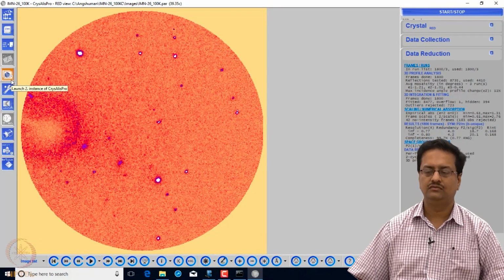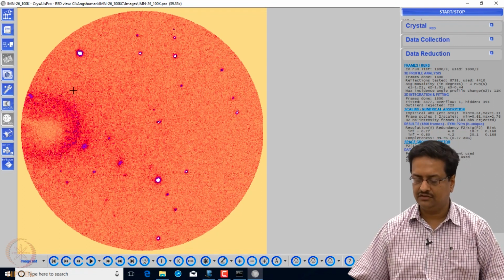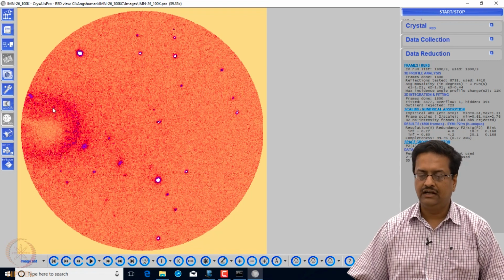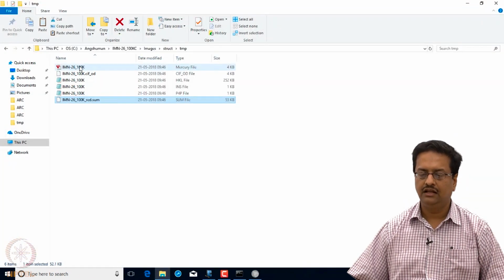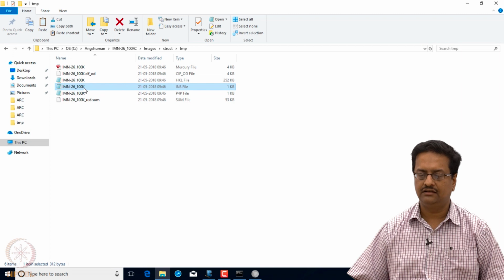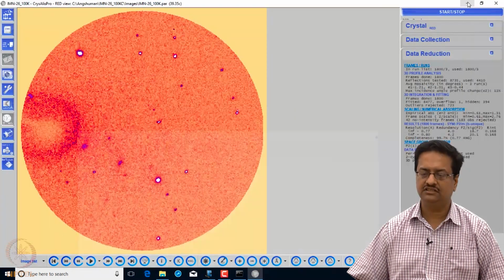Welcome back to this course on X-ray crystallography. In the previous lecture, I showed you how to handle one particular data set recorded using the Rigaku X-ray diffractometer, the mini tabletop diffractometer, and we showed how the data reduction can be done using the software. You have already learned the basic background on data reduction, and I discussed the various files that are generated, like the CIF file, the HKL, INS and P4P files, after the data reduction process.